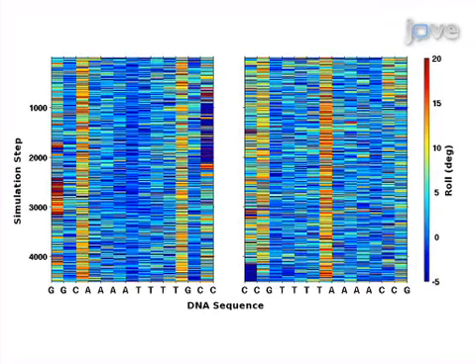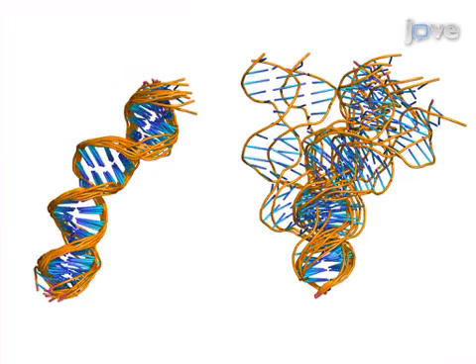The subsequent step is the analysis of a large ensemble of related structures. The final step is the alignment of a set of related DNA structures on a common reference frame in order to visualize global distortions of the structures.